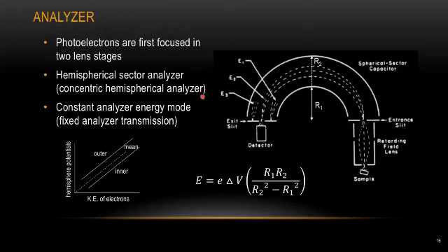Now we have the X-ray ready, and our sample generates some signal. The electrons will go straight into the analyzer for the XPS measurement. You can see the analyzer has two stages. Our sample is sitting down here. Once electrons come out of our sample surface, they go into the first stage, which is the focusing lens stage. The lens helps control the acceptance angle to maximize the collection angle, ensuring high transmission and sensitivity. Then the electrons enter the second stage, which is called the hemispherical sector.